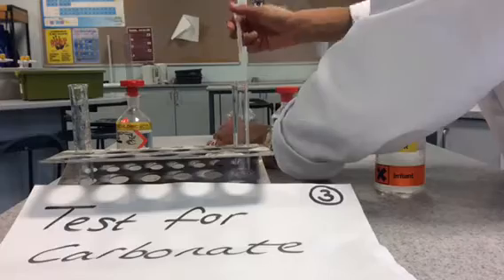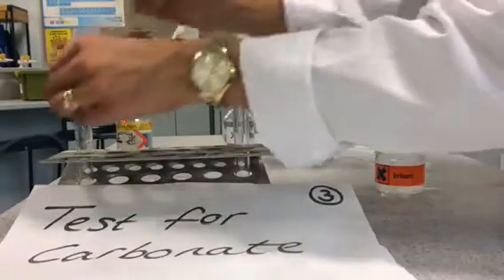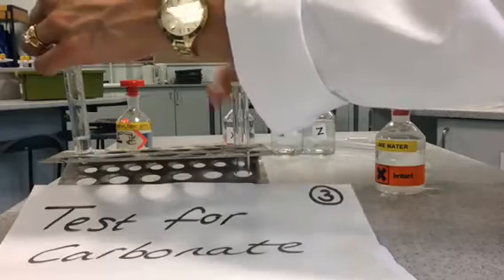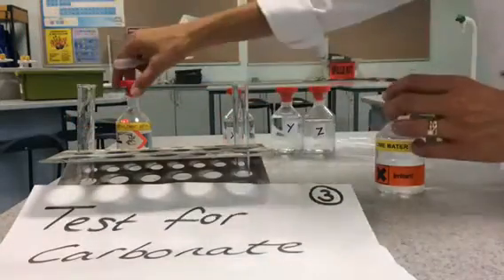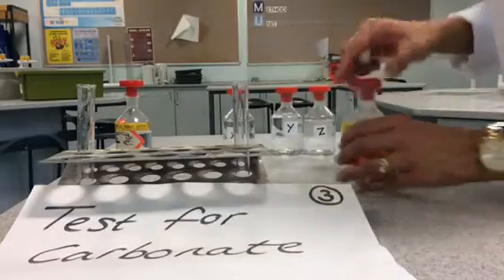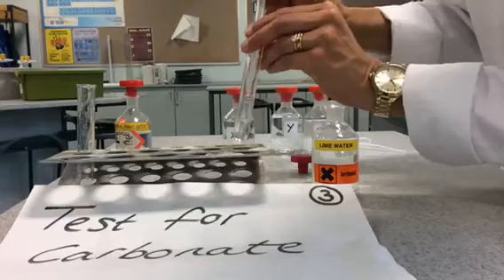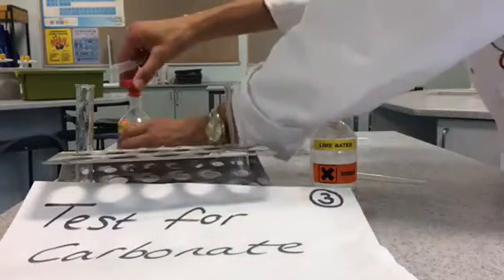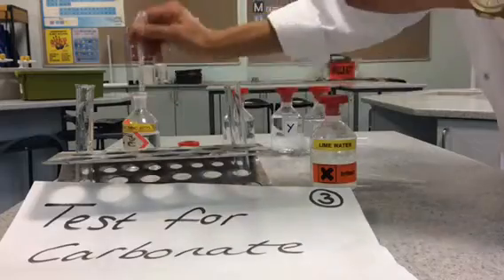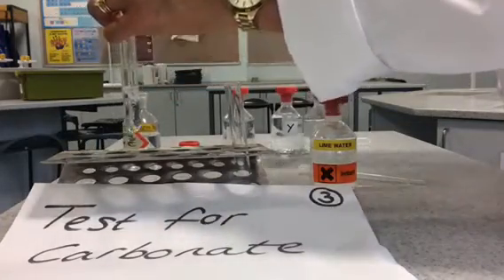Test for carbonate negative ions. Take one centimeter cubed of your unknown ionic compound and add that into a clean test tube. Then take one centimeter cubed of lime water using a fresh pipette and place that into a clean test tube. The lime water is going to be used to test for the presence of carbon dioxide gas. Then take one centimeter cubed of hydrochloric acid and react that with your ionic compound.